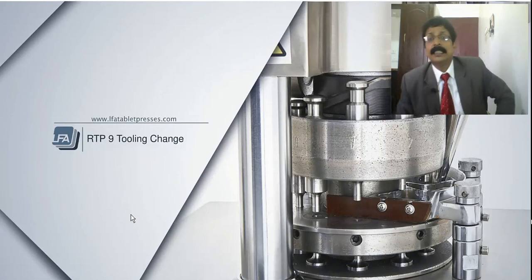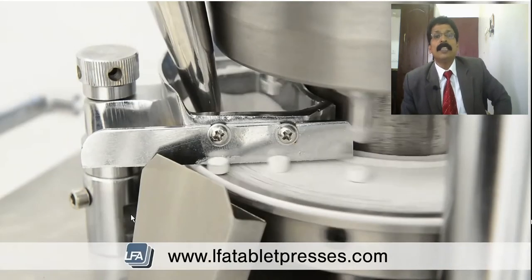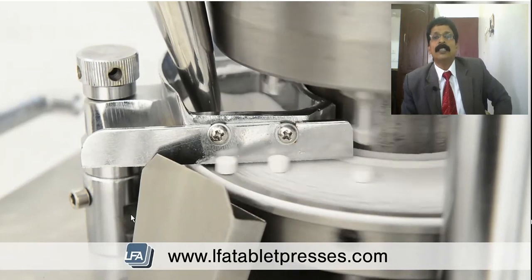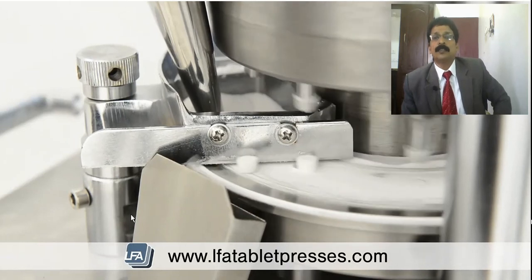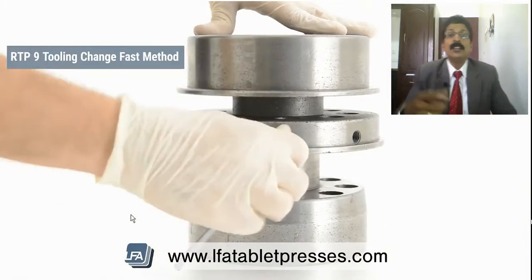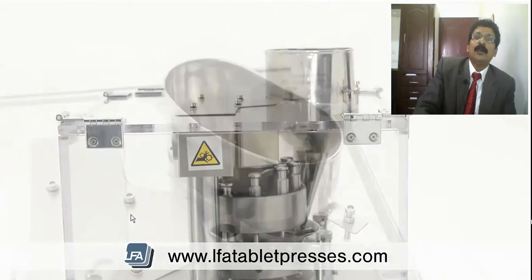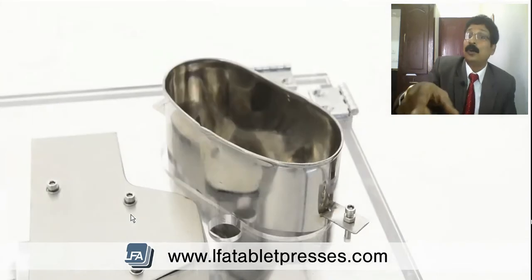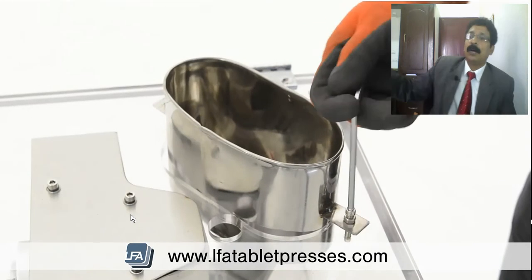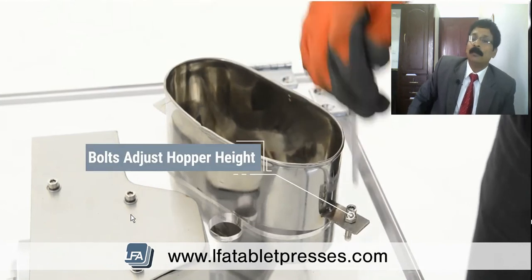See here, the machine is running now, and the tablets, it's a rotary compression. It's a small machine. It's not a double compression, it's only a single. So first he is going to remove the hopper. As we told, when it is finished, what do you have to remove first? You have to remove the hopper first and clean it. So he is removing the bolt of the hopper.